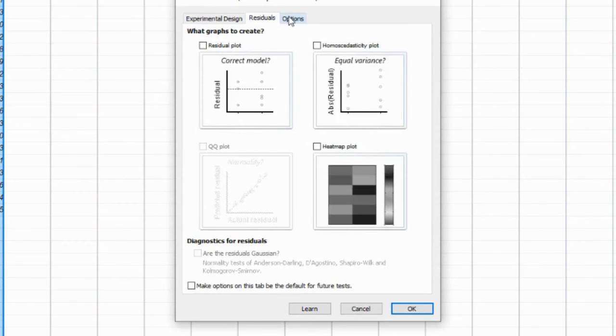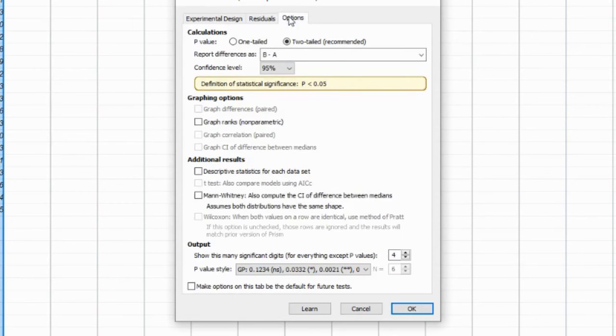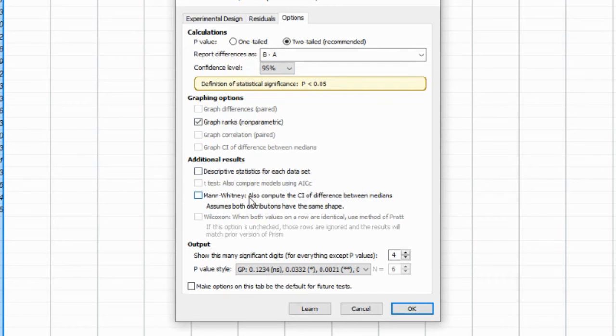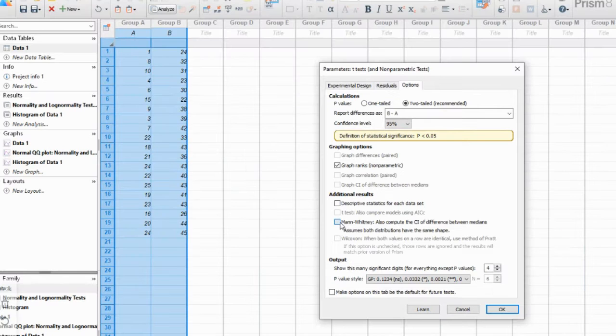The output of the Mann-Whitney U test provides valuable information. You'll see the U-value, which represents the sum of ranks for one group, the P-value indicating the significance of the difference between groups, and effect size measures.